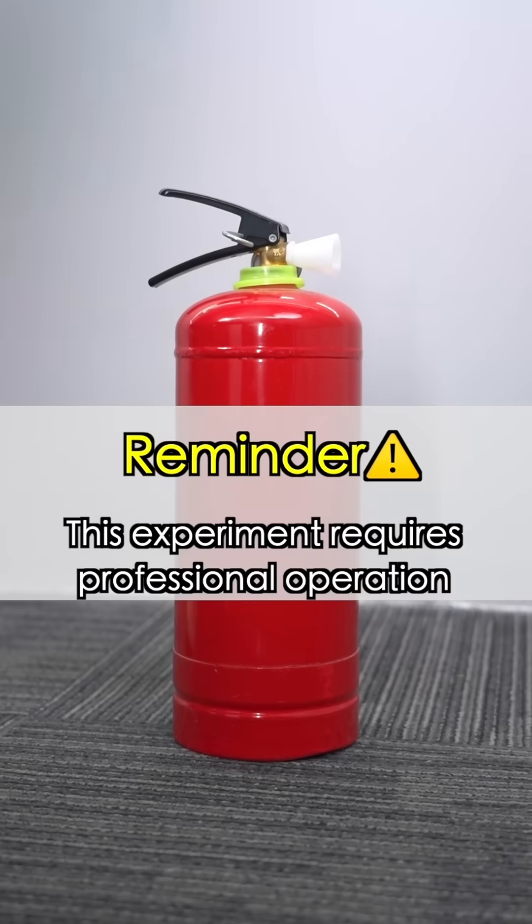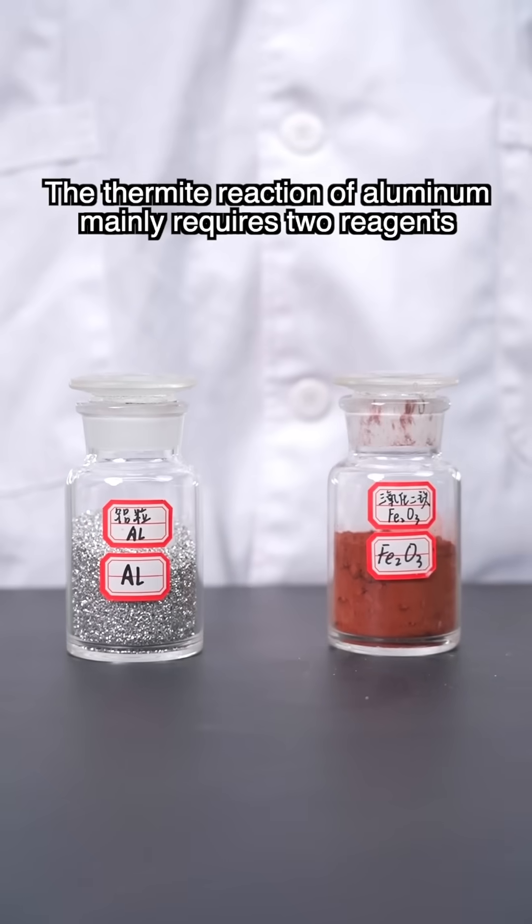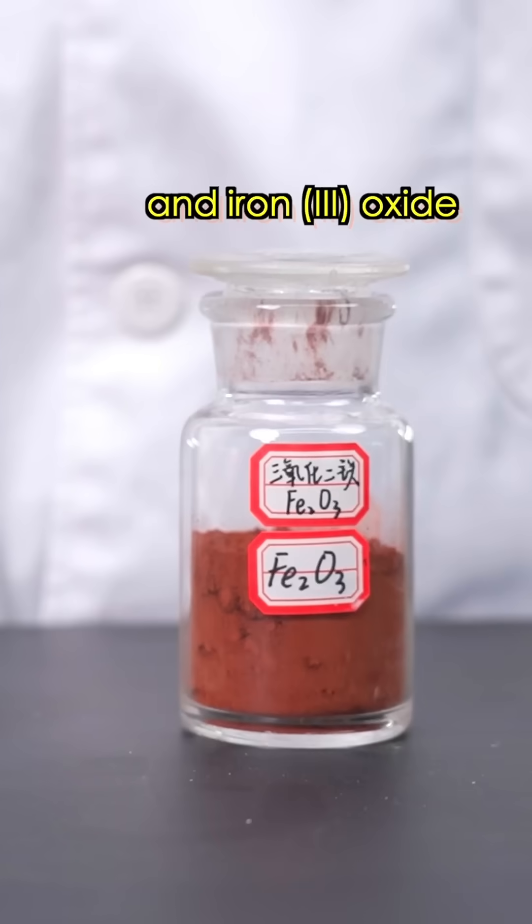Reminder, this experiment requires professional operation. Imitation is strictly prohibited. The thermite reaction of aluminum mainly requires two reagents: elemental aluminum and iron oxide.